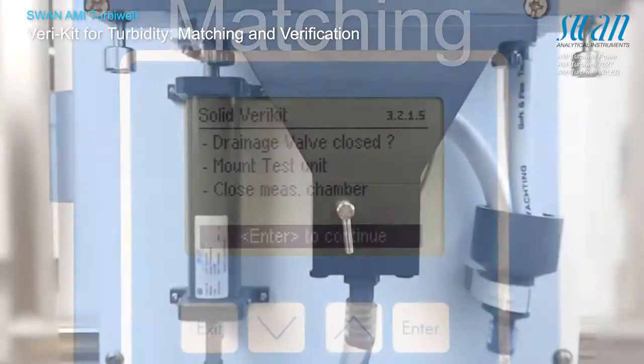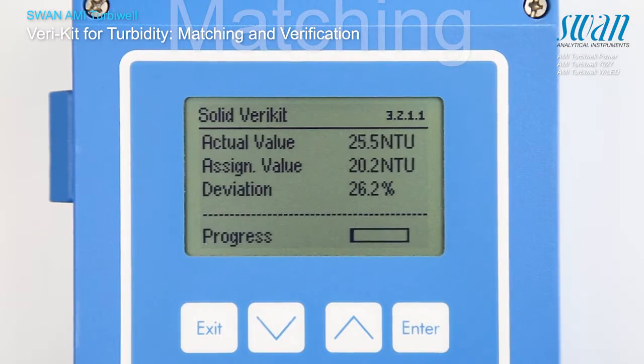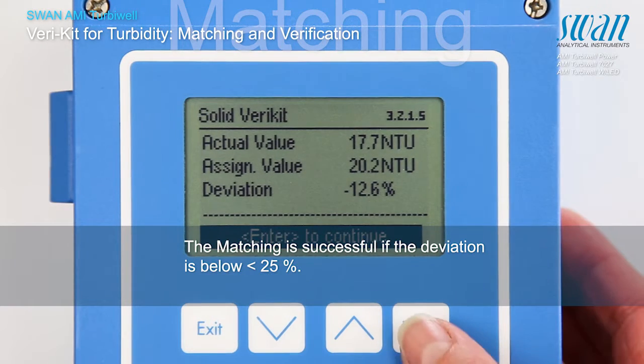Close the measuring chamber and start the matching by pressing enter. The values of the matching are saved.